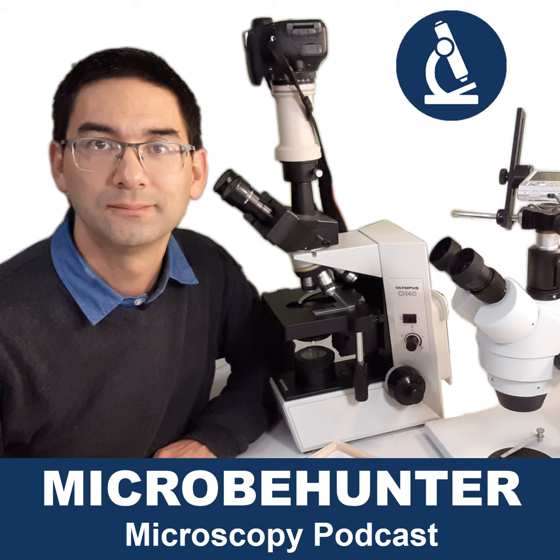Okay. So basically the point of this podcast episode is to provide some clarity, and I can already comfort you a little bit in the sense that it's actually much easier than it might appear, because when you go out and buy yourself a microscope, and it doesn't really matter which compound microscope you buy, if it magnifies all the way up to 400 times, you are already covered, and you can see, I would say, maybe 95% of the things that you probably ever want to see. Okay, so 400 times total magnification is already enough.